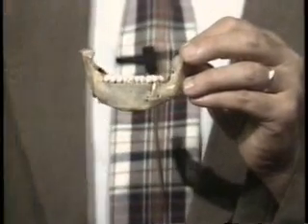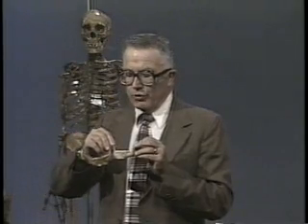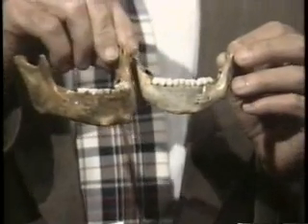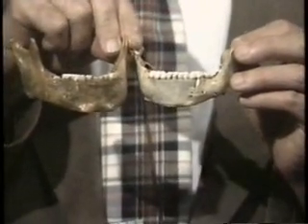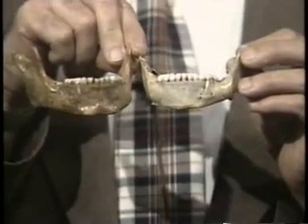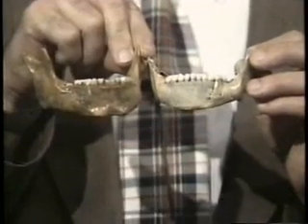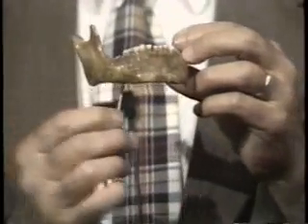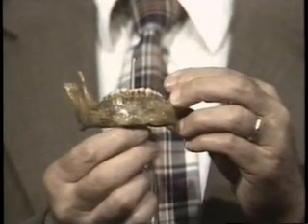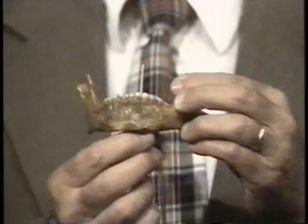But you know that as time goes by, individuals get larger, and what you have here now are two mandibles, the one on your right being 2 years of age, and the one on your left being 5.5 years of age. Note that the one on your left is larger than the one on your right, and also note that there are spaces between the teeth here. This is where the mandible has grown. In other words, the bone has gone on to grow, and you can see my little stick there between the teeth. You can see the spaces that occur there.